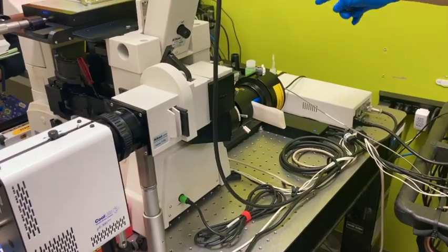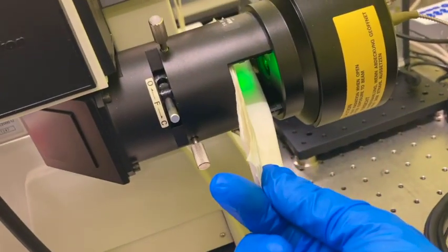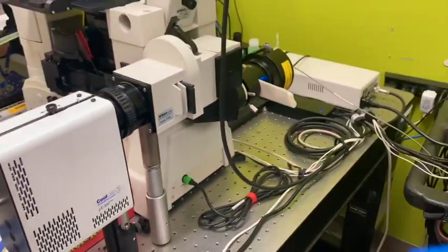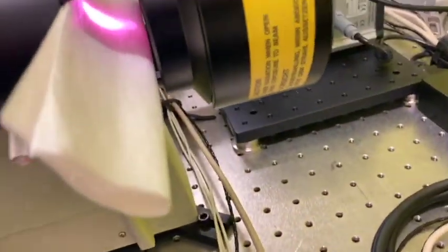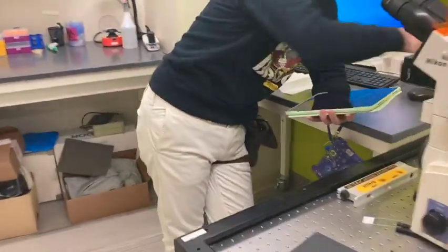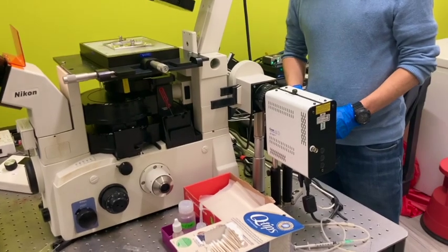Maybe you can turn the blue off and then turn the green on. You can see the difference. Yes, it's green, and then green off, and then we have red. And you can turn all of them on together, which means that's a combination of purple, kind of. So yeah, that's the way we control the laser.